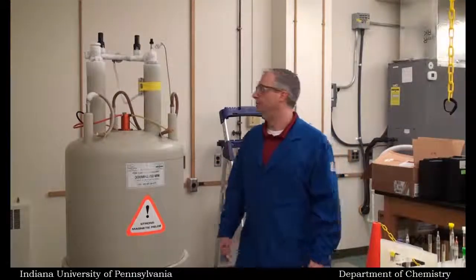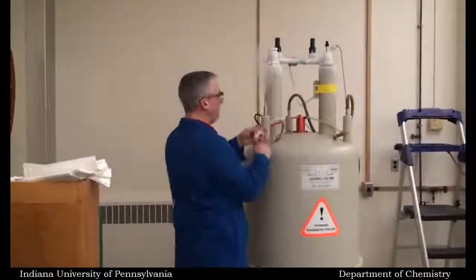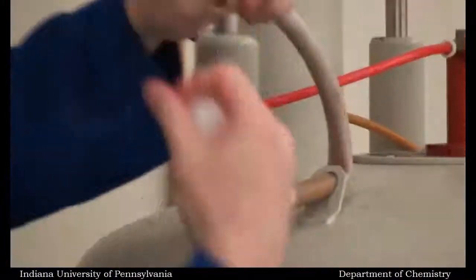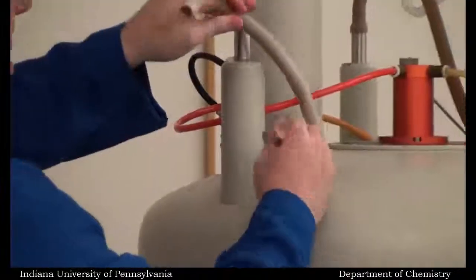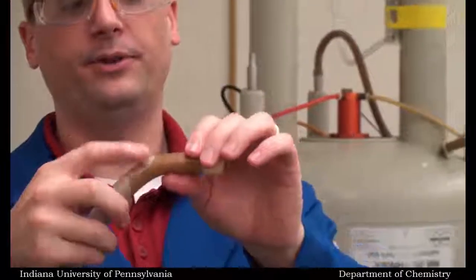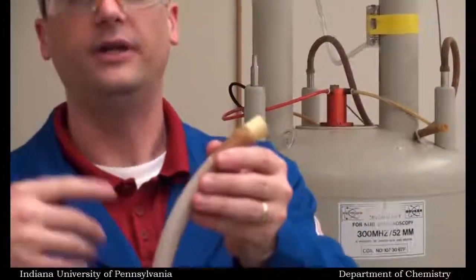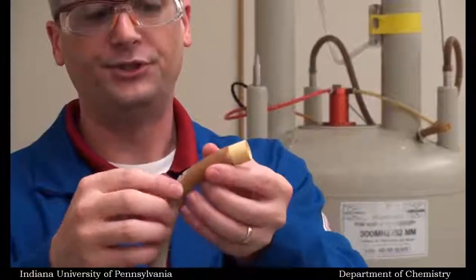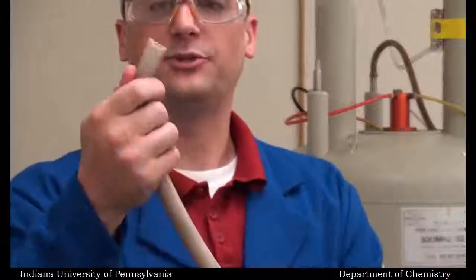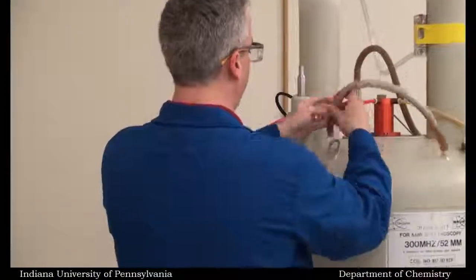Alright, in order to do this, you come to the first vent tube and you pop it off. Notice that this first vent tube always has the ice on it, and there's a reason why. This vent tube has a stopper just like the rest, but there is a slit in this one. So this is where it actually vents. When it reaches a certain pressure, it pushes this open, and it will allow the overpressure to be released. Again, that's why you have the ice formation on this one and not the others.